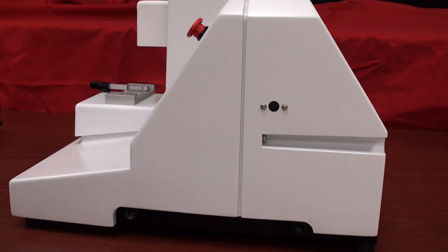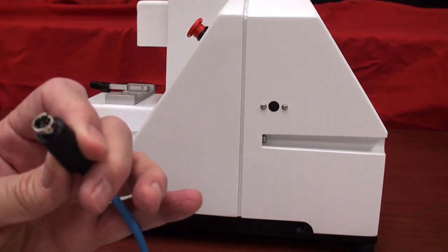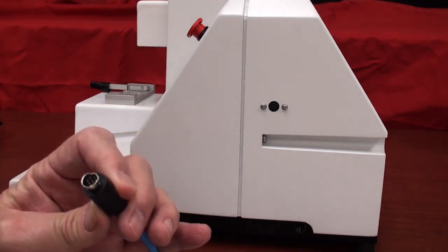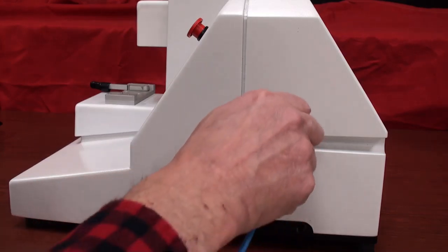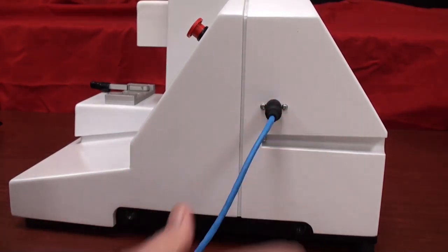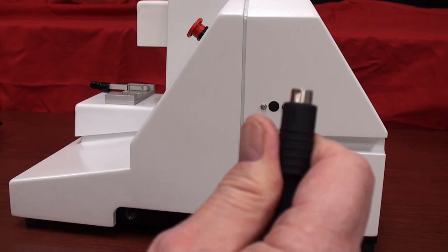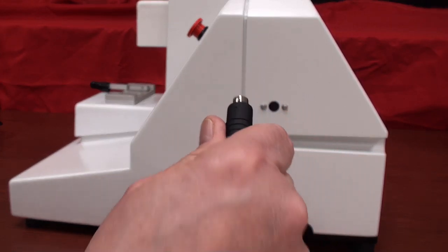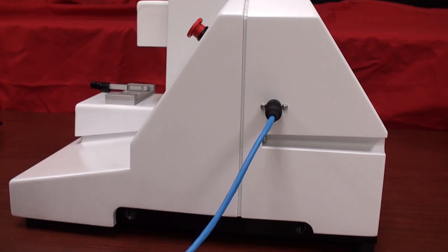The plug is keyed in a particular way, so there's only one way you can insert it correctly. Please note on the connector there's a little arrow — that aligns with the up position on the port, and then the Opti-Cal gets mounted on the stage, which we will talk about later.